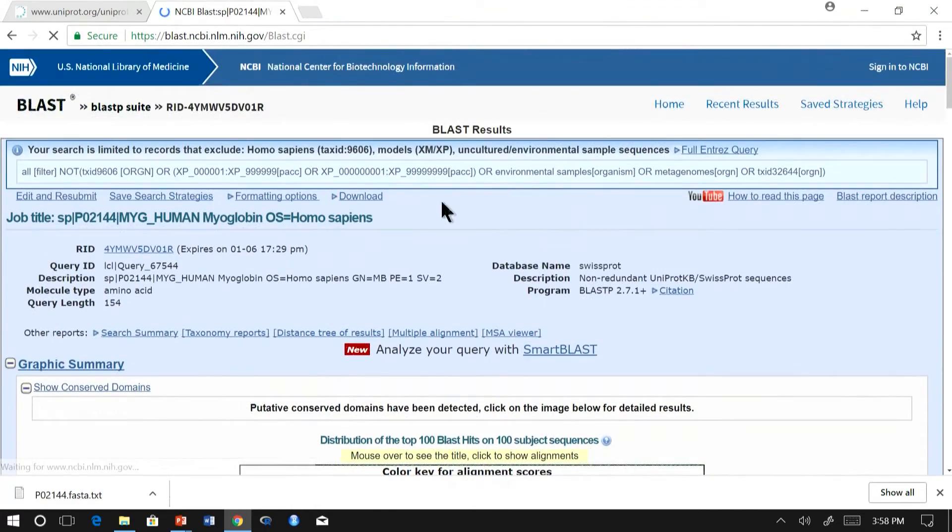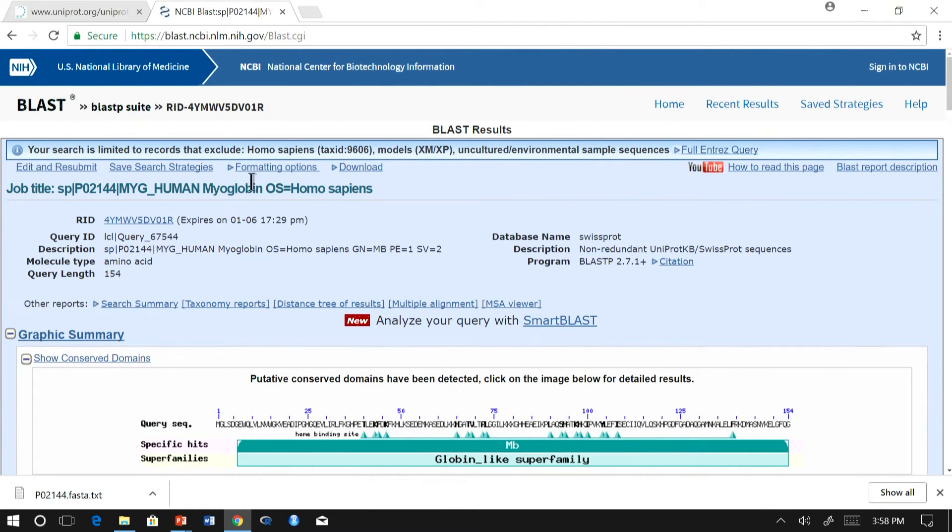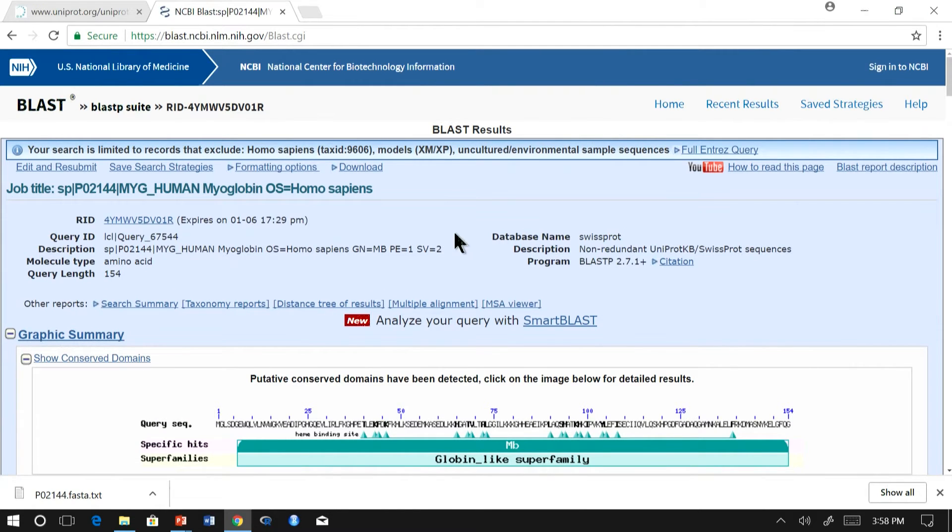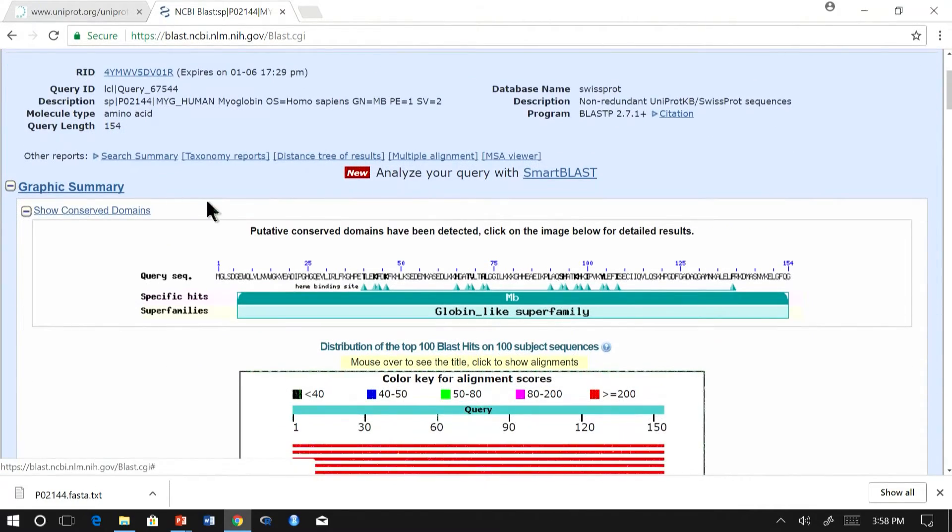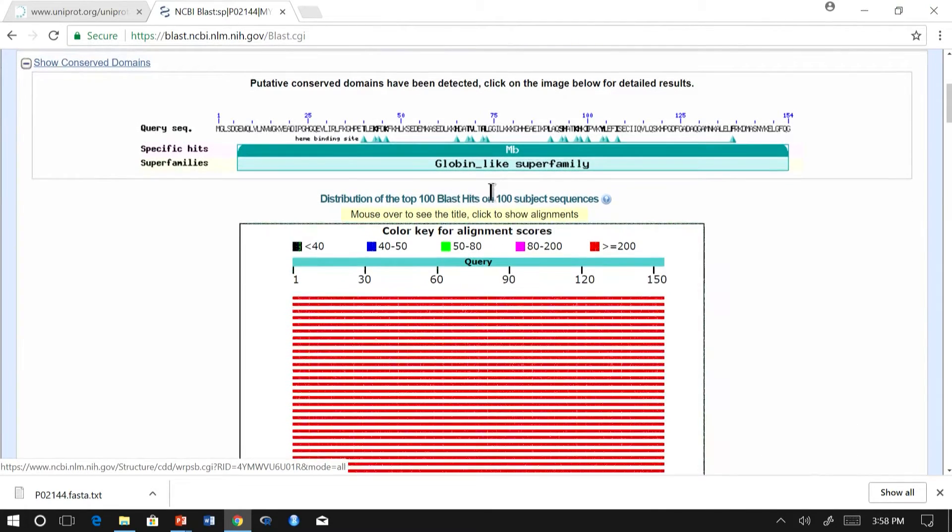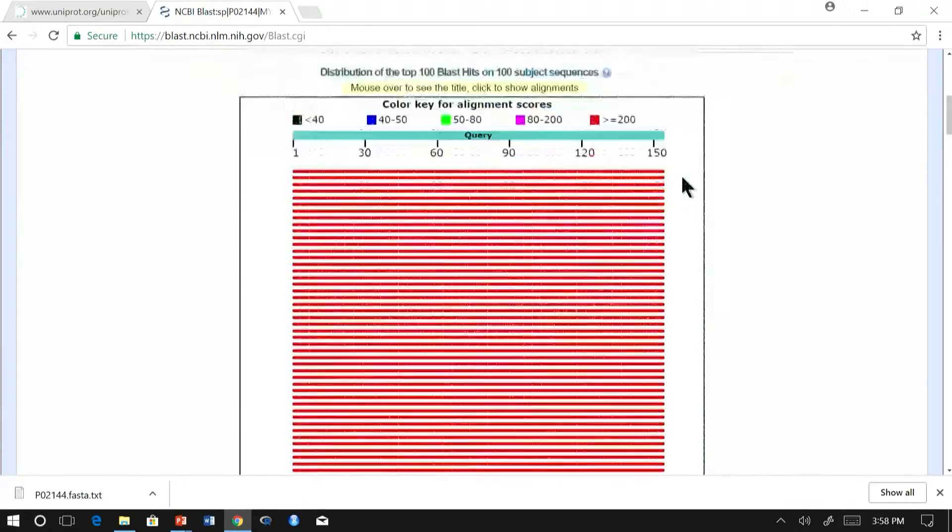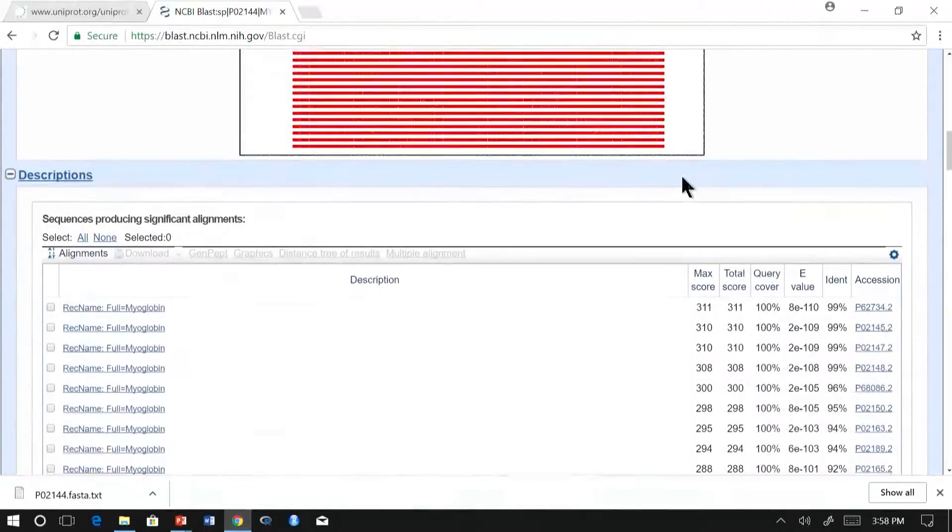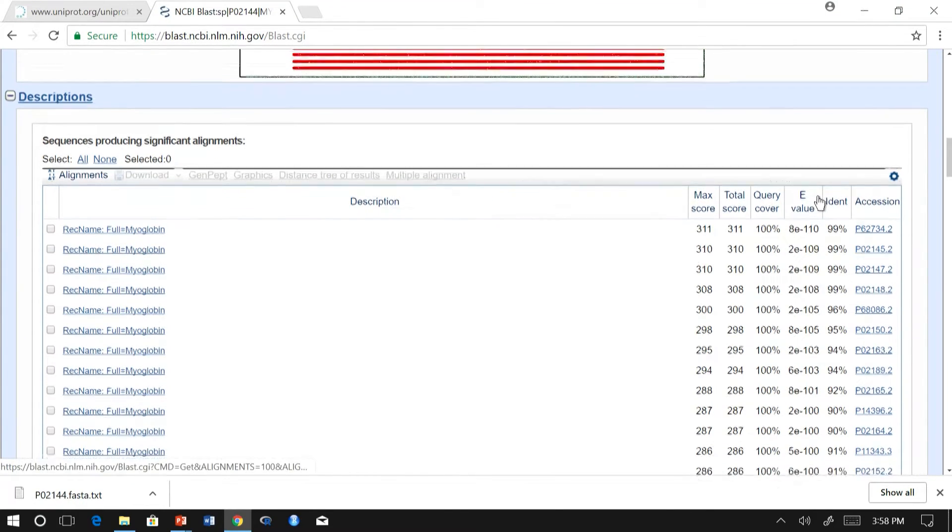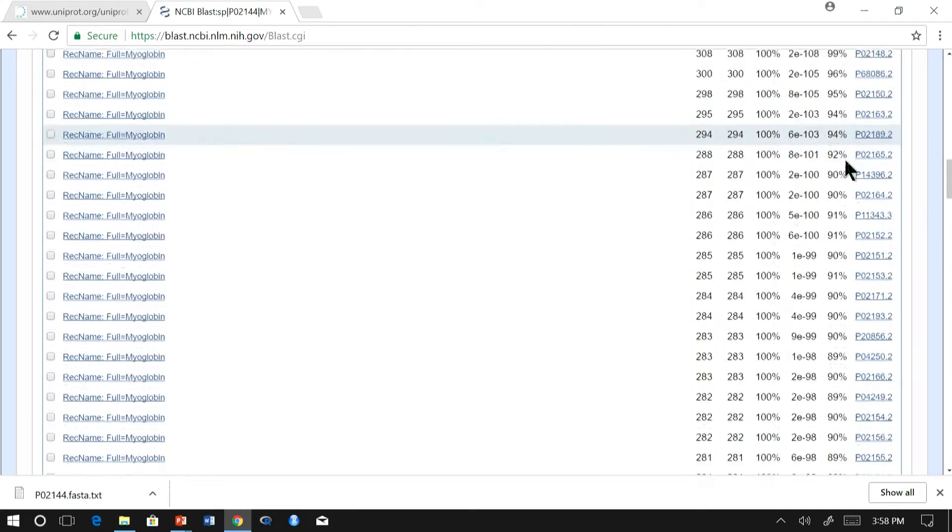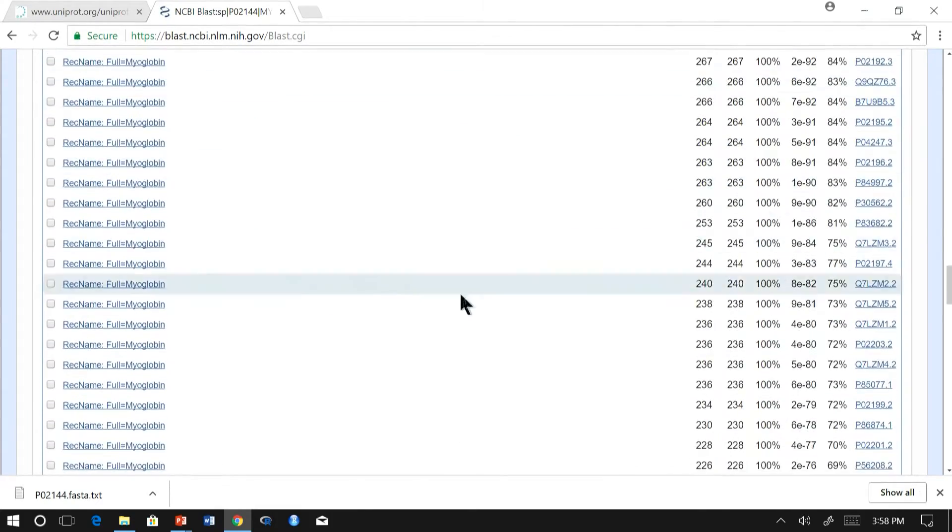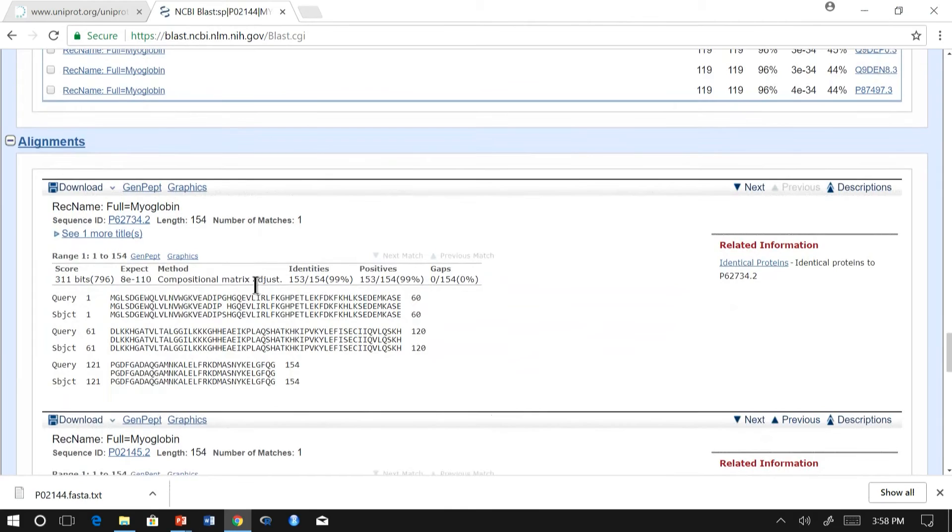The output from BLAST will have following sections. The first initial part will cover the job detail, the request which you have performed, the query and the database, target database. Further, you could see a graphical summary, which is very useful in case you want to find a region-wise conservation among the aligned sequences. Further, you could see a summary where all the alignments along with their score and the E values are listed, below which you will find individual alignments of each aligned sequence.